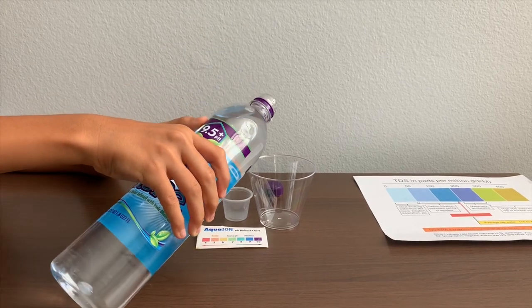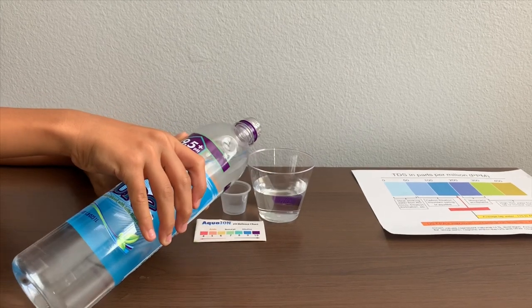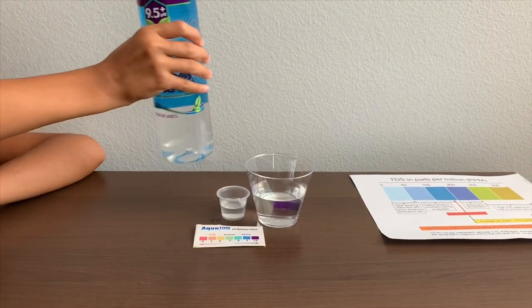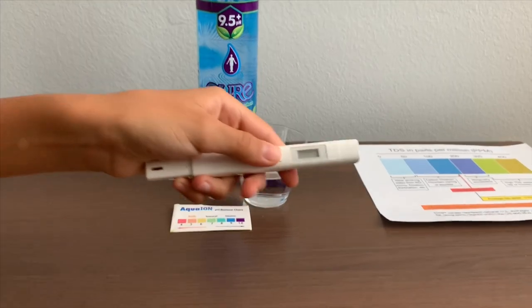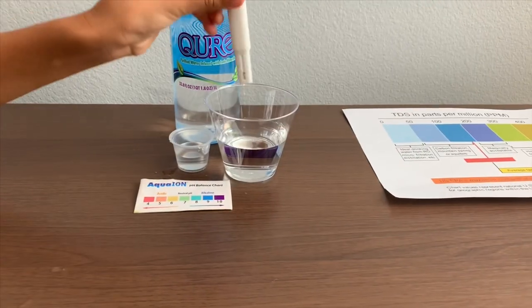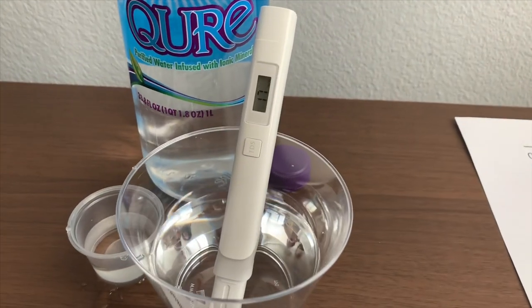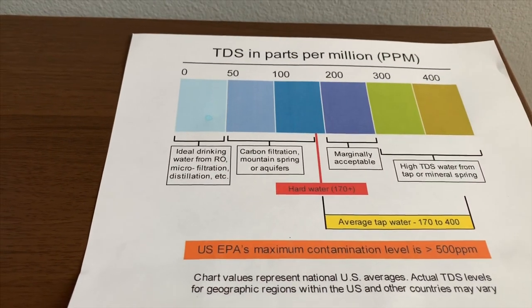Let's pour some water. Let's test the TDS levels first. If you want to buy this TDS tester, check the link down below. Turn on the TDS tester and make sure it says zero. Put it in and let's wait. 17 — that is microfiltered water.